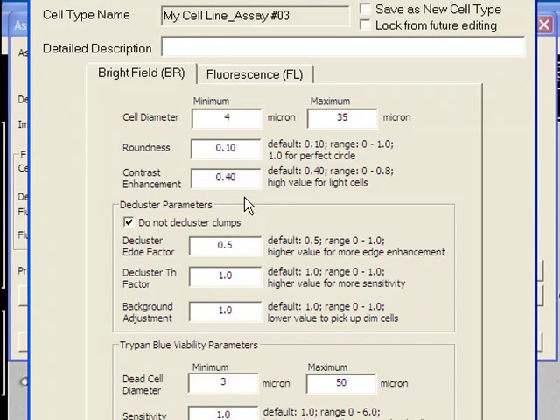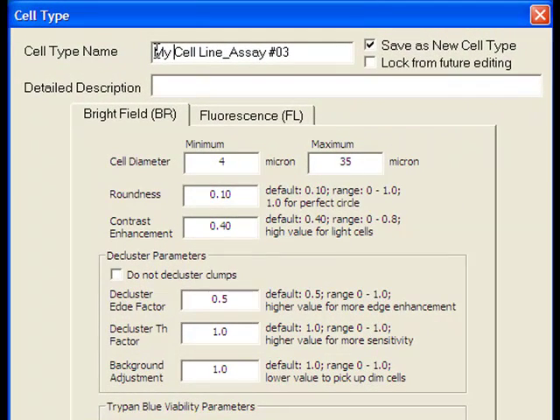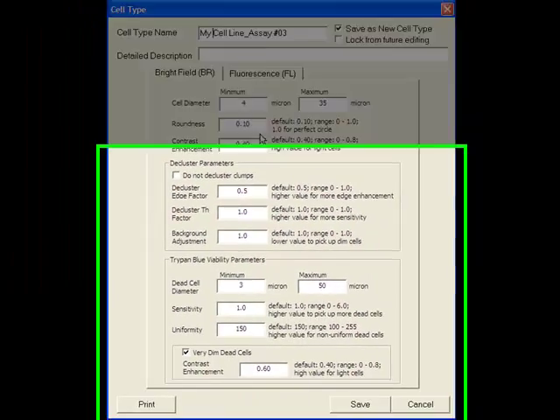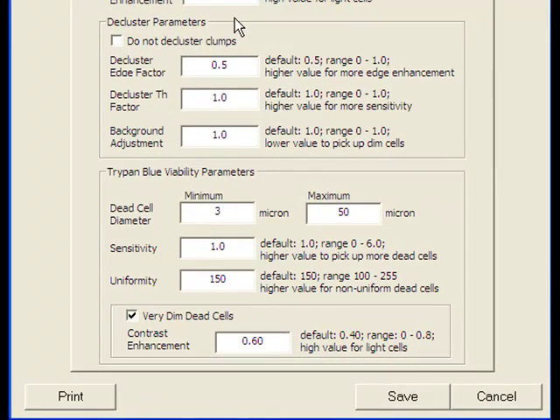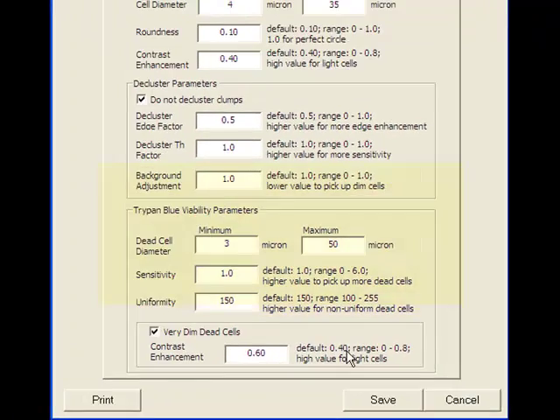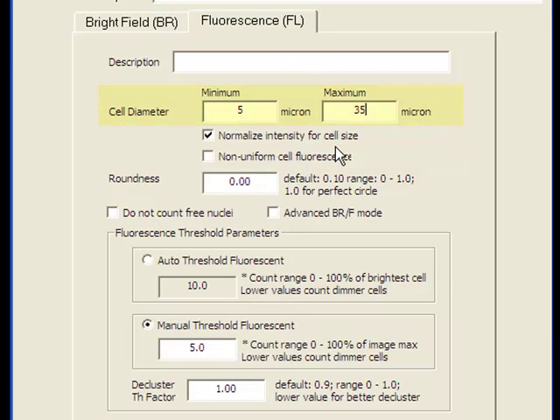To modify cell type, change the cell name. For bright field parameters, minimum and maximum cell size, cell roundness, and cell contrast can be modified. You can also choose to either count cells in a clump as individual cells or leave them as a clump. For trypan blue viability measurement, dead cell parameters can be set differently than live cells. Fluorescent cell parameters are for cell size minimum and maximum.